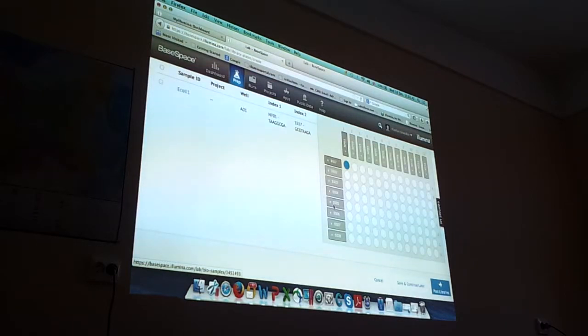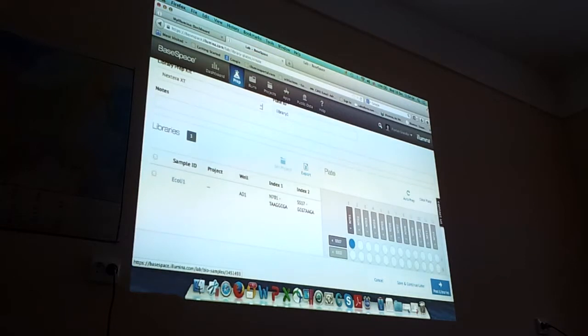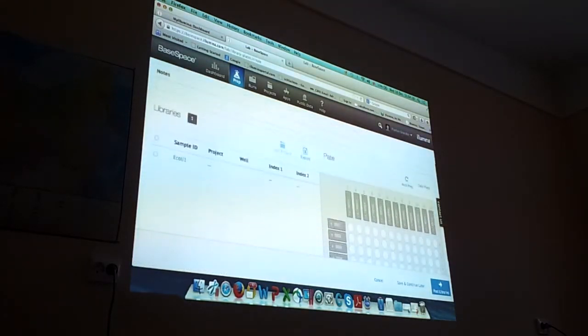So let's see. Probably you can put it on another one. I clear it, and then let's see this one. Where is it?